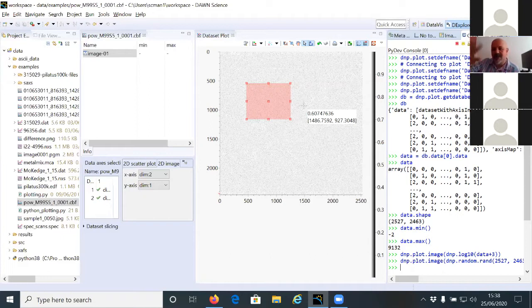Through all this exercise, we are changing the data, but some of the regions are still there and didn't change. We are only affecting the data on this plot, or if you like, the data used to generate this plot is what's changing.